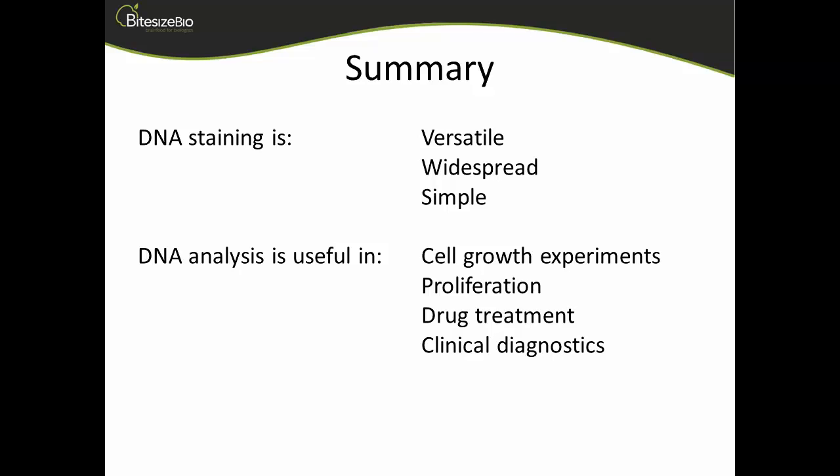Question here, is there an approach that's good to separate cells within G2 phase and M phase? It depends what you want to do. Yes, we can specifically target mitotic cells by using antibodies against proteins that are specifically expressed in mitosis. So we use an anti-phospho-H3 antibody quite a lot, which is specifically phosphorylated in mitosis. But in order to detect that, we need to fix the cells. So we can get a percentage, we can get a mitotic index. We couldn't do anything with those cells afterwards.